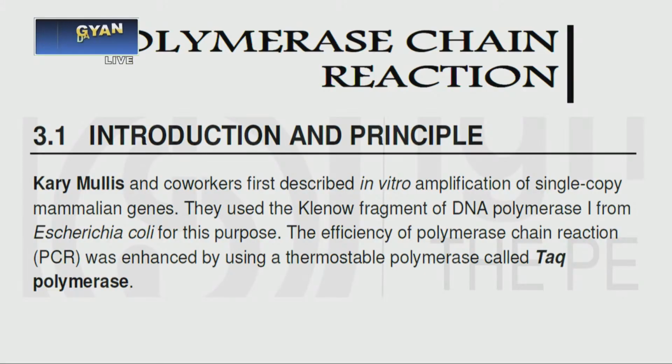Now we come to the next experiment, that is your experiment number 3, that is polymerase chain reaction. In short, it is called PCR. Now, perhaps by this time, the students who have started your courses, either in the first year or in the second year, should be familiar with what is meant by PCR. Polymerase chain reaction. What is the purpose of doing PCR?